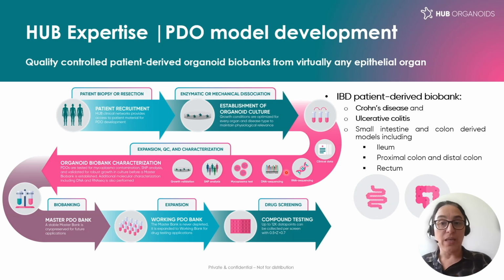So in the context of IBD, we already have a biobank that consists of around 30 models from 15 different patients, in which we can represent patients that have been diagnosed with either Crohn's disease or ulcerative colitis.